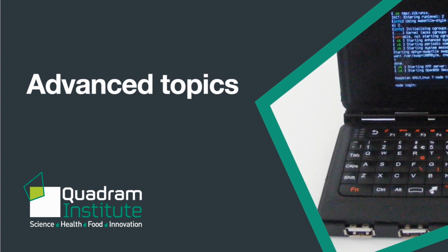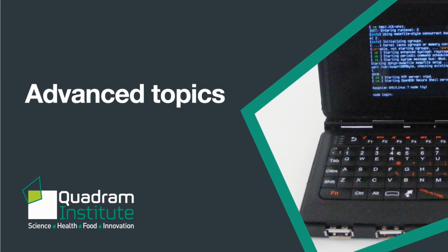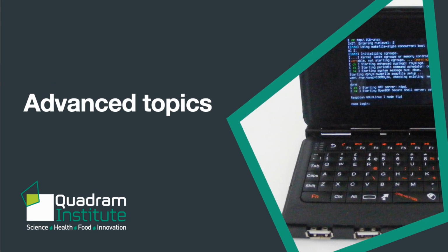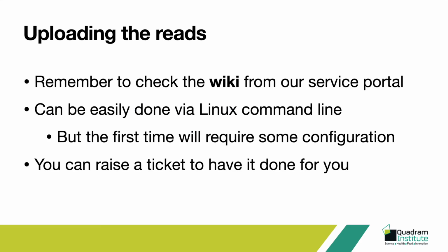Finally, let's briefly introduce some advanced topics. Here the goal is to give an idea of the process and pointing you to check the documentation from the service portal rather than guiding you step by step. The first topic is how to upload reads to IRIDA. If you have just one sample or two, you can do it from the web portal, but the recommended way is to use the HPC where the software to do so is already installed.